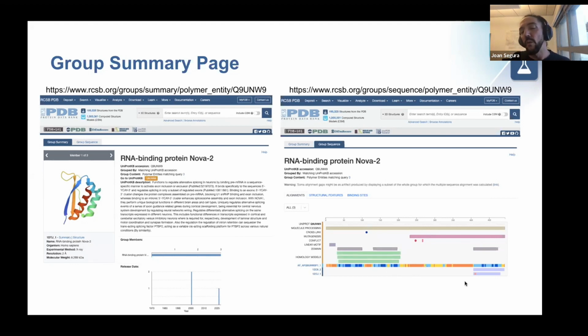So I think this view can be quite useful because it gives you an overview of the relationship between the local scores and the alignment of the experimental structures.